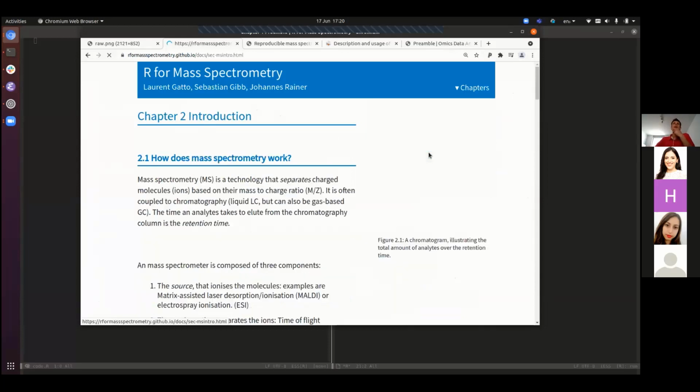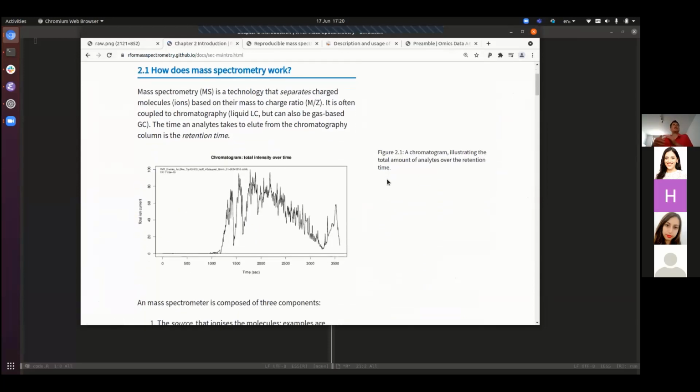And the first thing I would like to do is to explain how mass spectrometry works, because I'm absolutely convinced that if you want to be good in data science or bioinformatics in particular, it's extremely crucial to understand the data that you have at hand. I don't think you can treat a matrix of quantitative data of, let's say, transcriptomics data or proteomics data in exactly the same way.